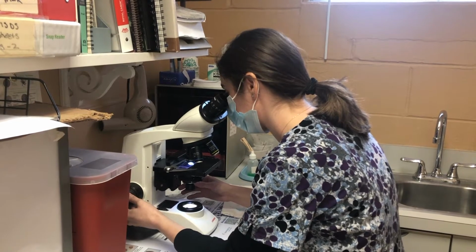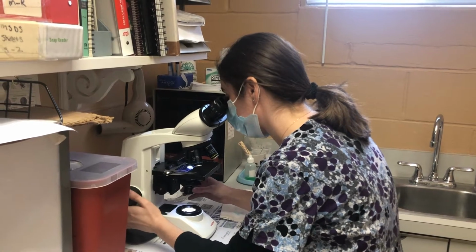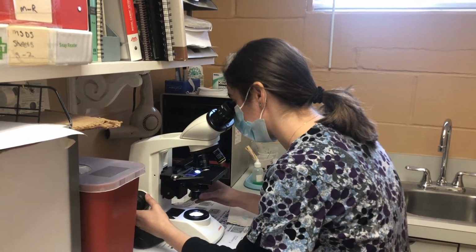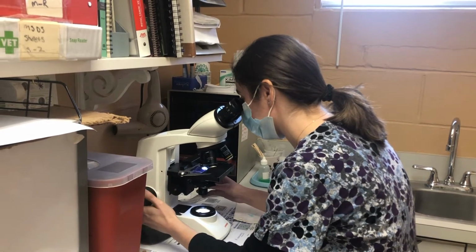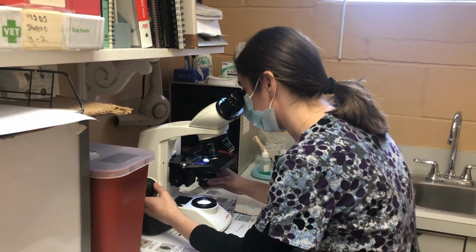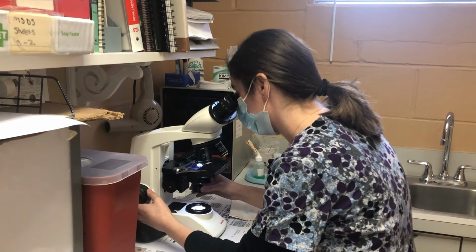Alright, so right off the bat I can see it looks like a parabasal cell. It's circular in shape, and it's not the smallest size that it can be, but it's pretty small. I'm also seeing a little bit of bacteria, which can be normal flora in the vagina. Still seeing another parabasal cell. Some debris.